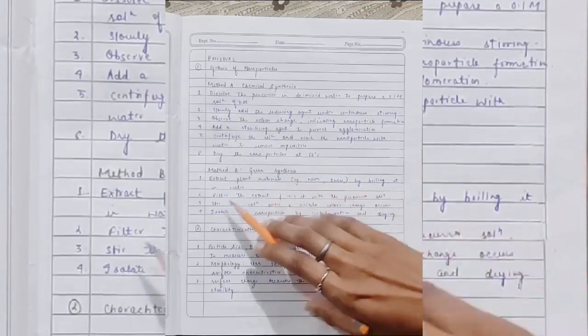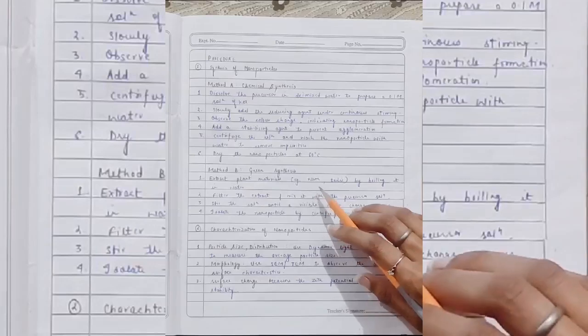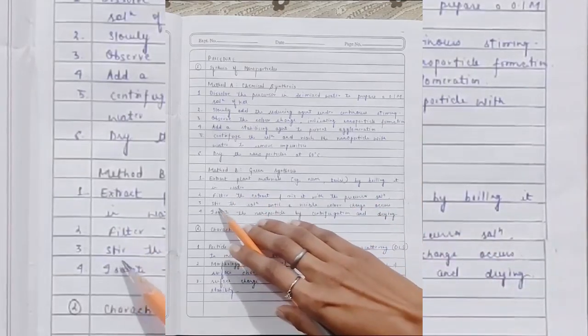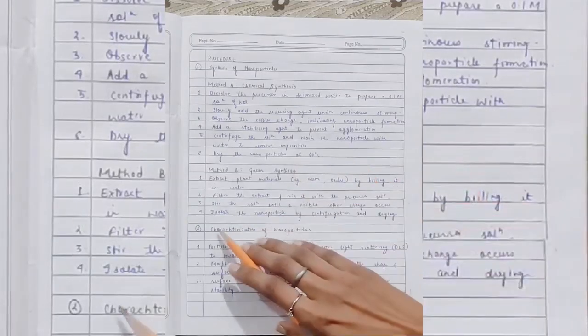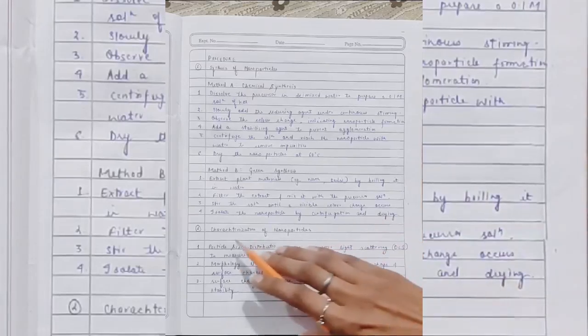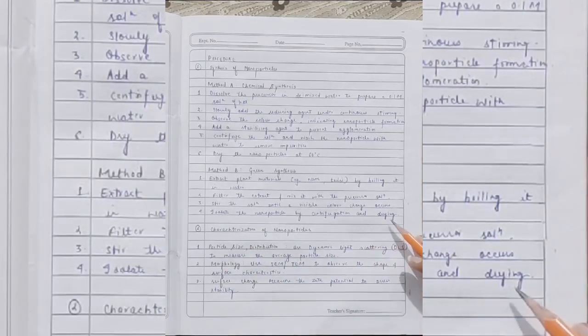Moving ahead to the next method, that is method two, we can use green synthesis for the extraction of nanoparticles. First is extract plant material, for example, we can take neem or tulsi by boiling it in water. Next one is filter the extract and mix it with the precursor solution. Third, stir the solution until a visible color change occurs. And in the last, isolate the nanoparticles by centrifugation and drying.